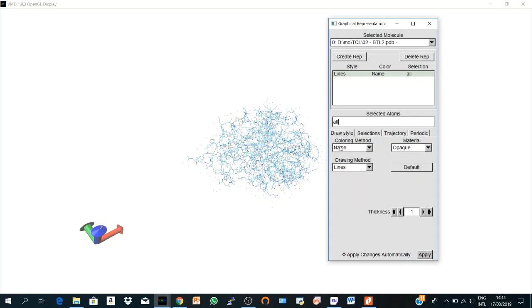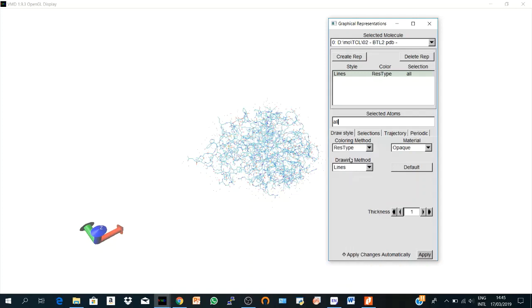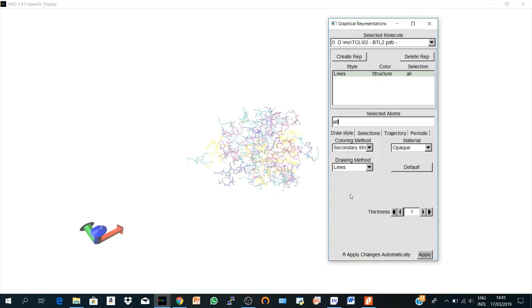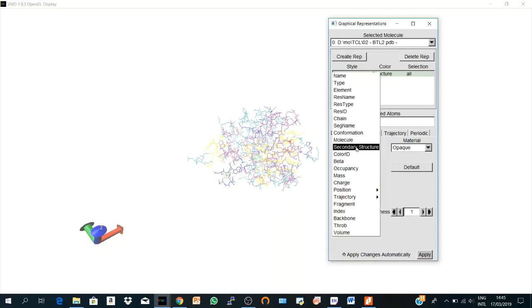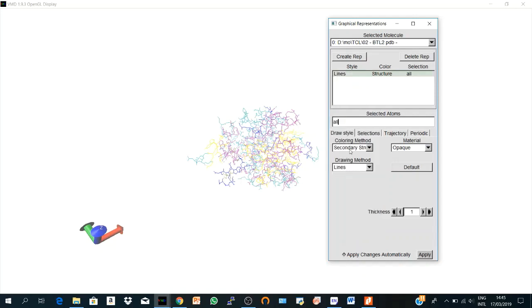And here we have a coloring method. So now it's by name. It could be colored by res type, polar, non-polar, etc. It could be colored by secondary structure, and you can choose so many coloring methods. So let's keep it secondary structure.